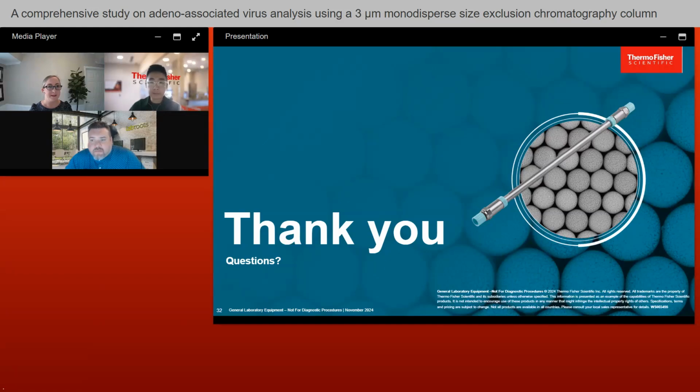Thanks. I would just like to jump in there too. We do have a great application note on our ProPac 3R SAX for ion exchange, and that can certainly help as a tool for empty versus full too. So couple that with your SEC for aggregate analysis, and you have multiple methods that you can help determine critical quality attributes for those various AAV serotypes. Yeah, thanks, Ashley. All right.